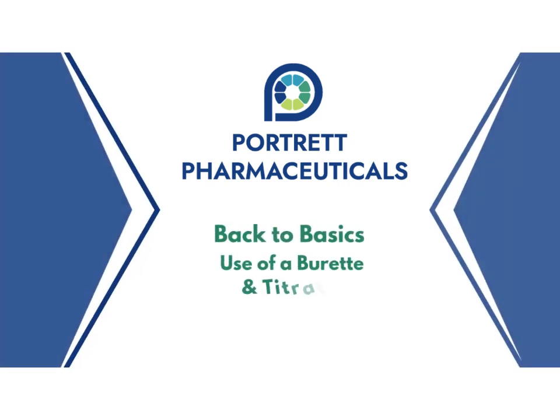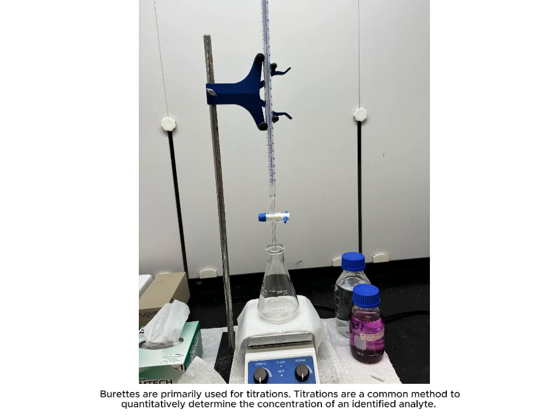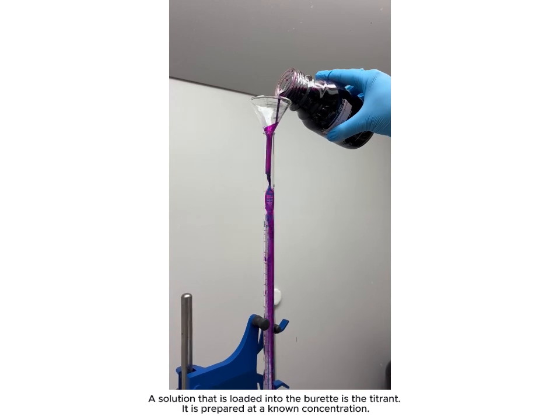Back to basics. Use of a burette and titrations. Burettes are primarily used for titrations. Titrations are a common method to quantitatively determine the concentration of an identified analyte. A solution that is loaded into the burette is a titrant.